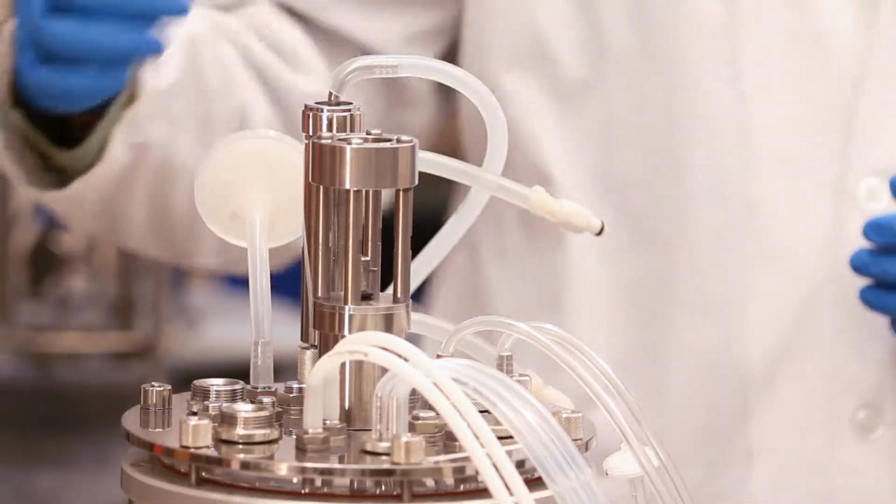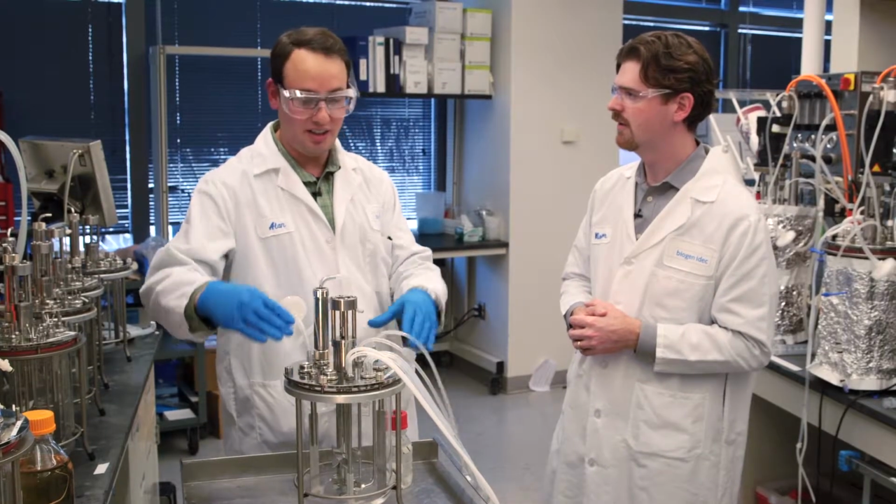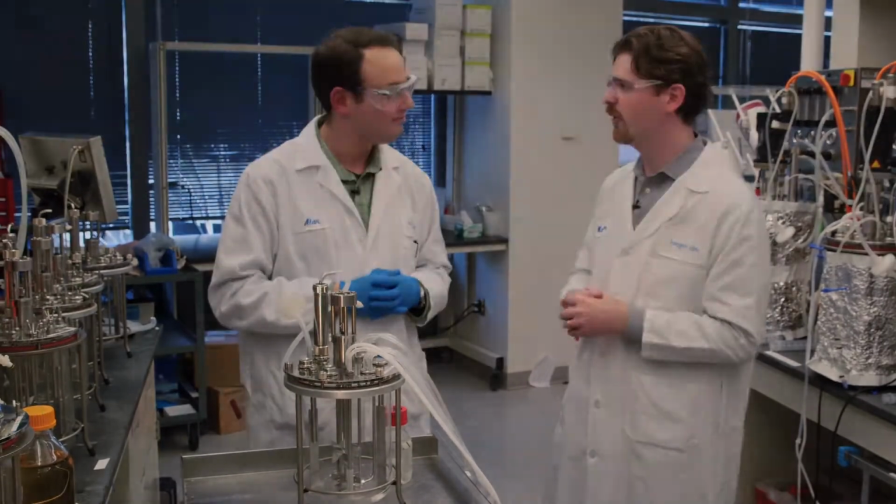So the only thing we're missing is still the pH and dissolved oxygen probes. And once we have those inside this reactor, it's going to be completely sealed off and can be taken ready to go. Let's go take a look at those probes.